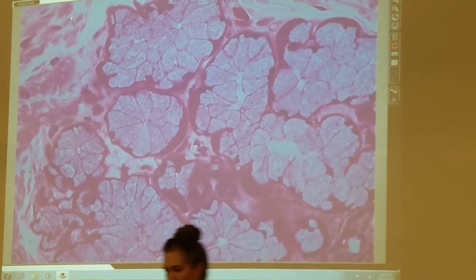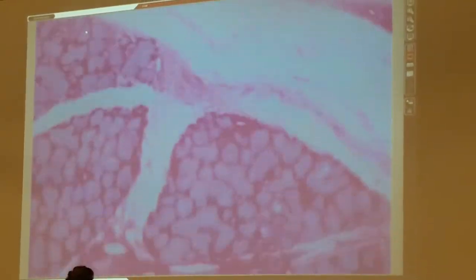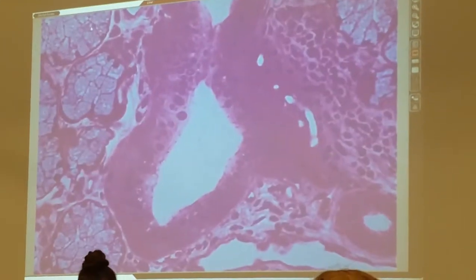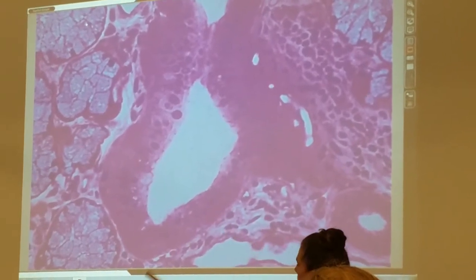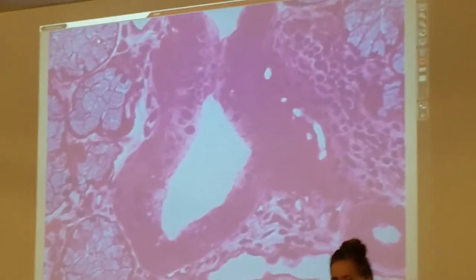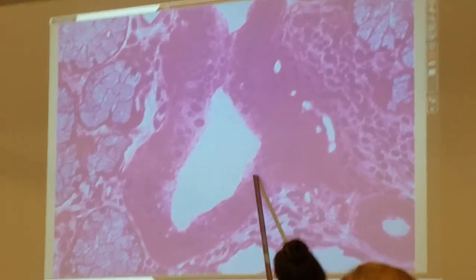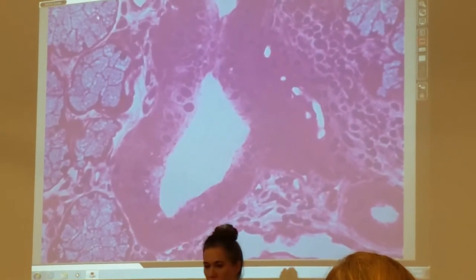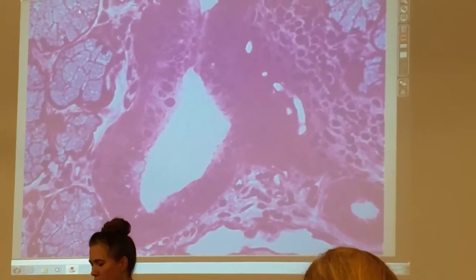If you see large amounts of mucous acini taking up most of the screen, that's the sublingual gland. And again, you can see those little cells there — the serous demilunes. I can ask any number of these structures, and these are going to show up probably a bit more clearly. Those are salivary ducts. The salivary ducts are going to look the same in the sublingual and the submandibular — so it will just be a salivary duct. You can see the nice uniform cuboidal cells there. A salivary duct is a salivary duct, so there's not going to be any difference there.